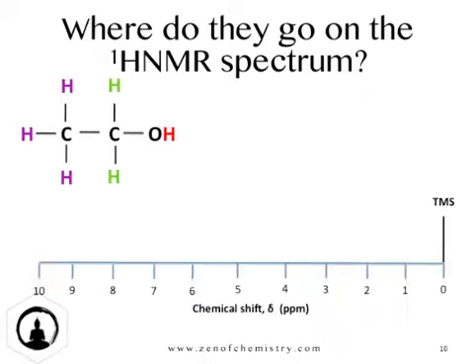What we need to do now is have a look at where they go on our NMR spectrum. So we'll start with our 3 hydrogens over here.